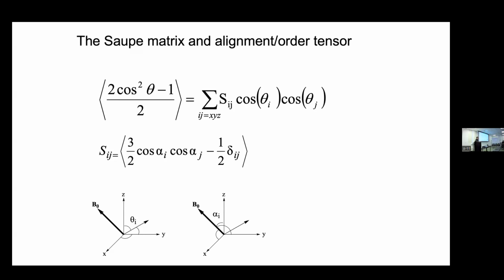Now, a lot of crystallographers will come and say, oh, you're adding 20 mg per ml of phage into your sample, and you're having some distortions in your spectrum. Your phage is manipulating your protein or nucleic acid. But I tell people, actually, in a cell, what's the concentration of stuff inside a cell? It's like 100 mg per ml. So when we put 20 mg per ml of phage in, I argue we're making it more physiological. It's more like a cell.